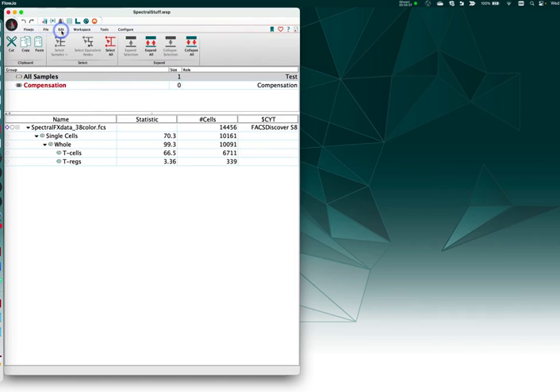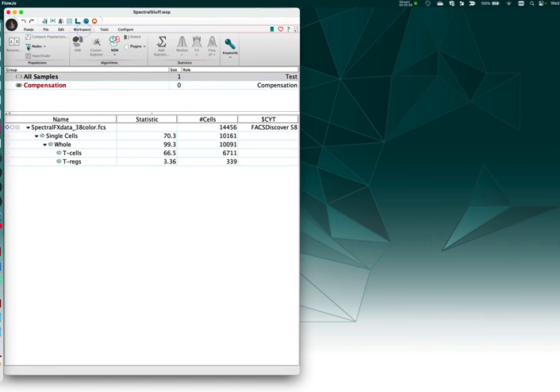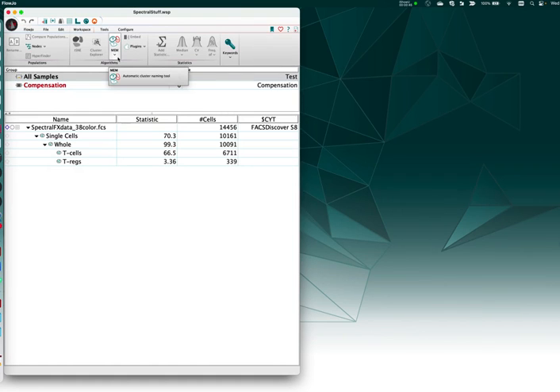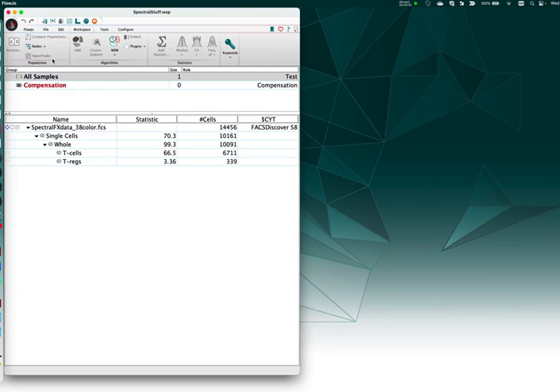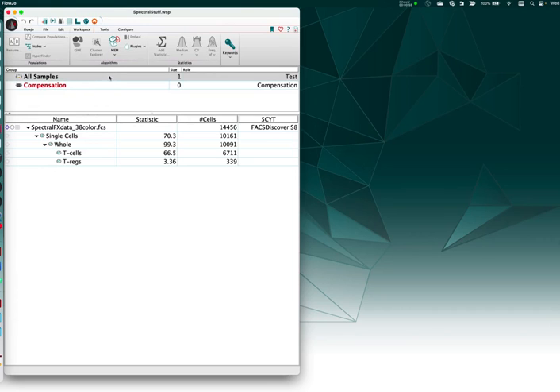File and edit are the same, but workspace you'll notice by default now has an algorithms band in which T-SNE, Cluster Explorer, MEM, etc. are now grouped together, so you have greater arrangement flexibility. Populations is a separate band which now houses the HyperFinder tool built into FLOGIA, as well as the compare populations tool moved over from the tools band.